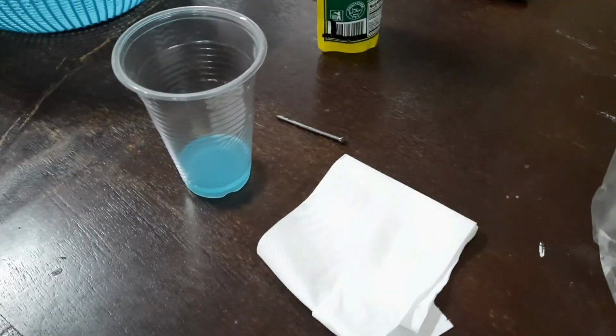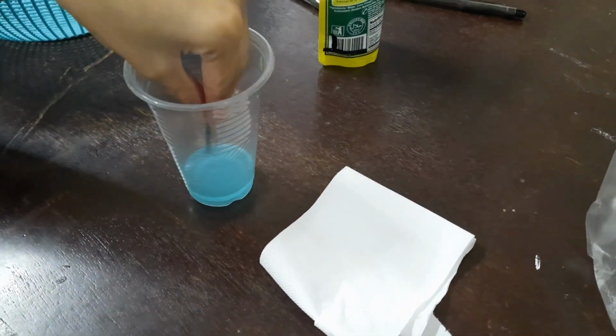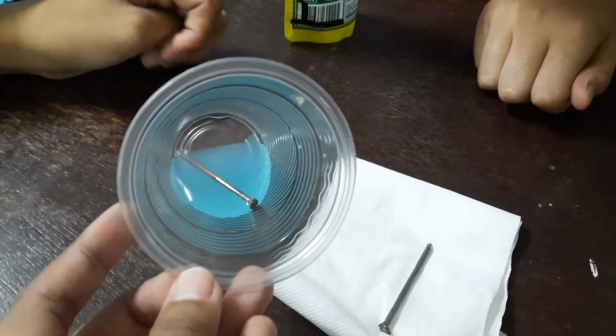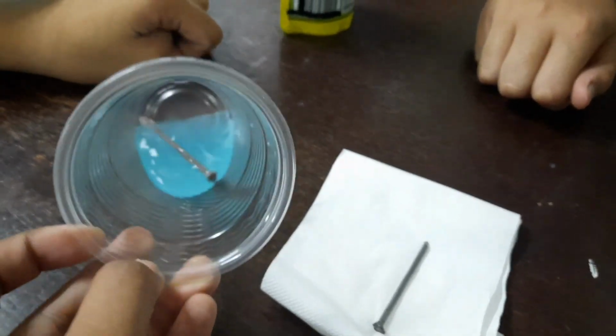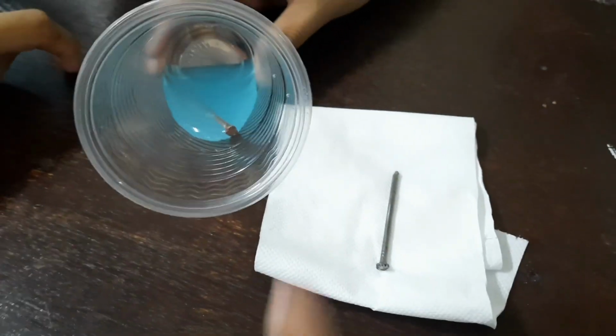For set A, place one nail on copper sulfate solution and the other on a clean sheet of tissue paper. Second, observe the nail in the copper sulfate solution and compare it to the iron nail placed on the piece of tissue paper. Compare the copper sulfate solution in the small beaker to the copper sulfate solution with the nail on it.